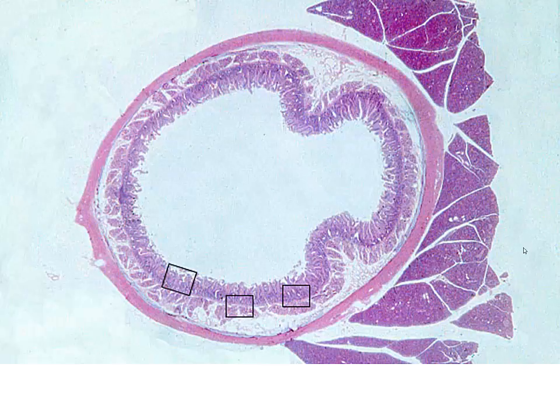Now, as we look at this cross-sectional view, once again, we can see two very nice examples of our plicae circularis extending upward here. Here's another plicae circularis coming in. We've got our mucosa, submucosa, muscularis externa. Then we have all of this material present in our submucosa. They're not lymphoid nodules, and certainly you're never going to see a muscularis mucosa that expansive.